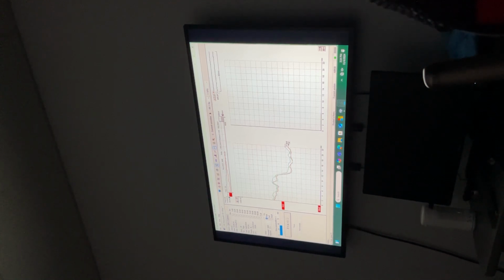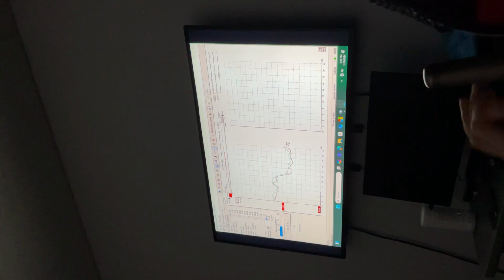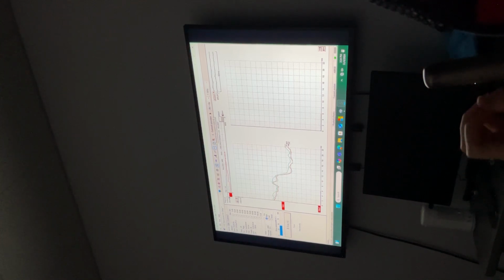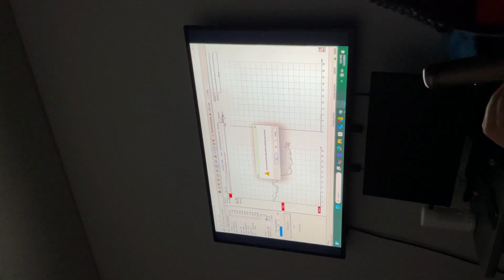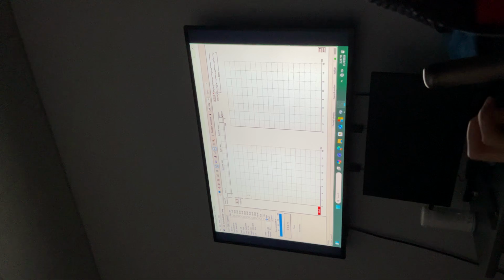Well, I accidentally did mine on 27.7. We just made it take longer. Yeah. But did you get better responses like that? I'll start a new session. No, I don't think so, because we were in a loop back. Actually, I might have, because that was for 500. And I was able to get like 10. It's sticky right here. There, it is sticky, like you said.